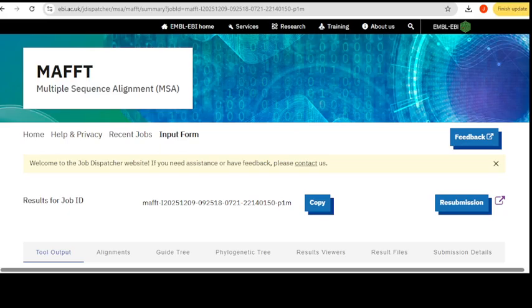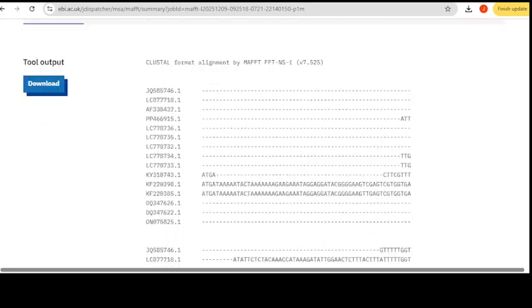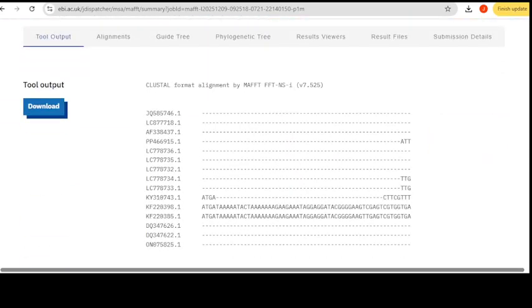So let's see our final video. Hopefully, we will create a nice and wonderful phylogenetic tree in this final video here. Since we were on this website, ebi.ac.uk, and we already created our MAFFT file, which is right there, we have downloaded this file already.